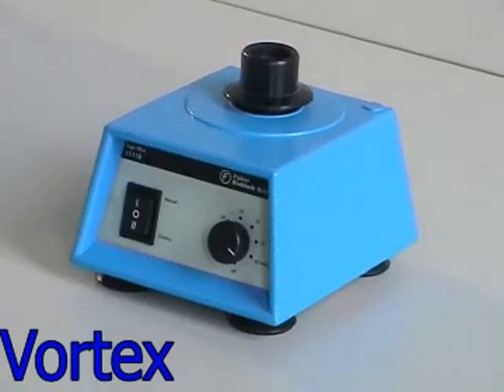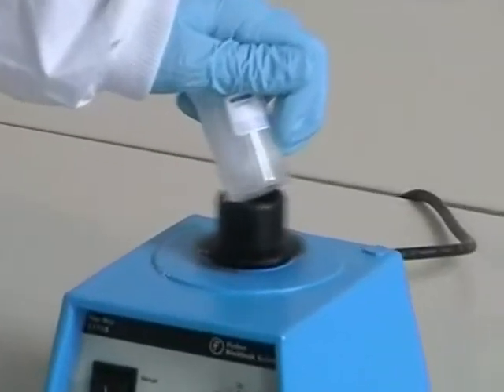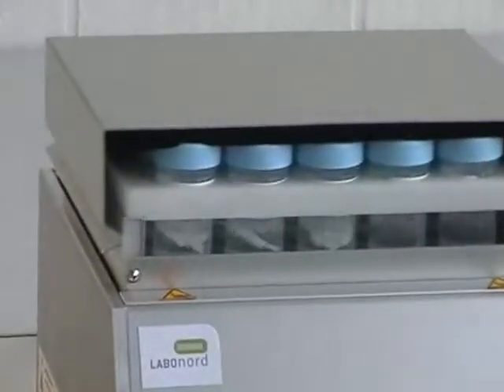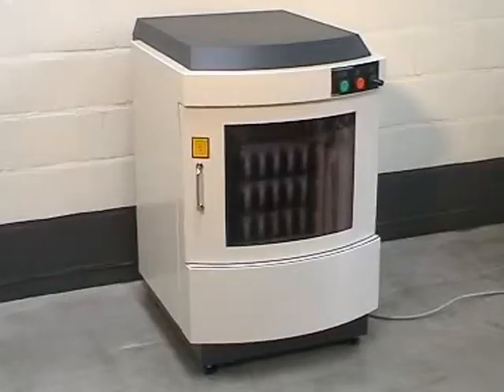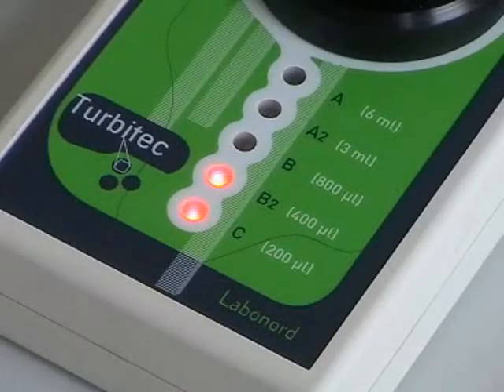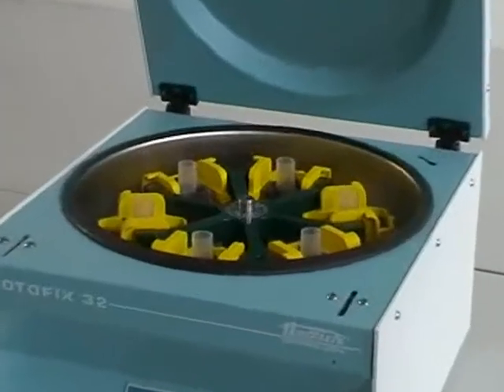Turbitec has a low investment cost. Equipment options include a small vortex shaker, a medium shaker for 25 vials called the Turbyshaker, or a high throughput shaker for 75 vials called the Cytoshaker. Additional equipment includes the Turbitec cell scanner and the six-slide centrifuge.